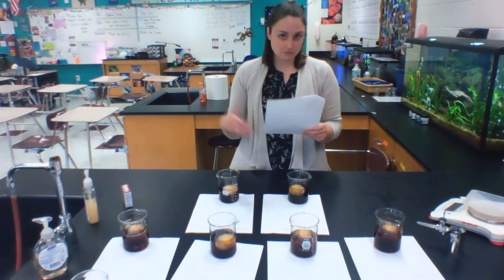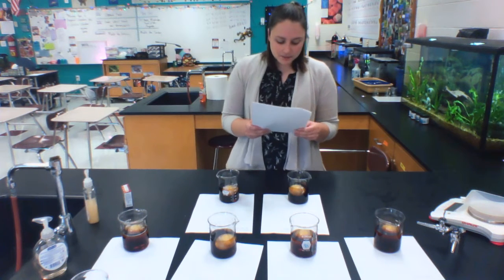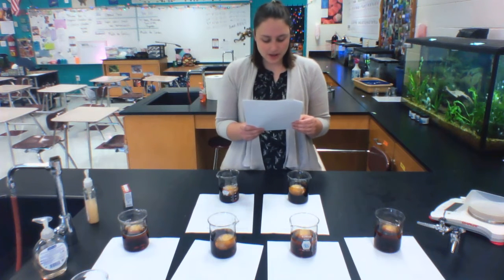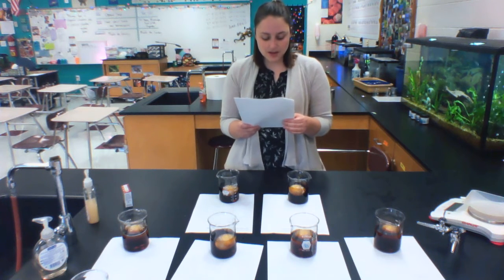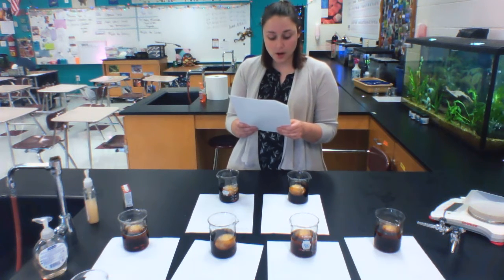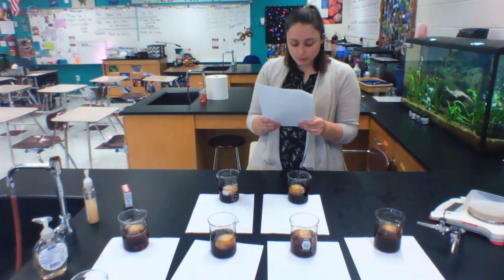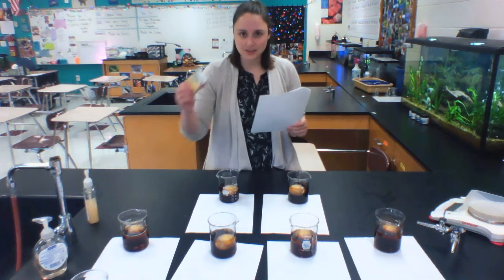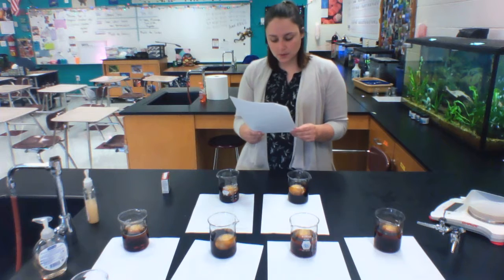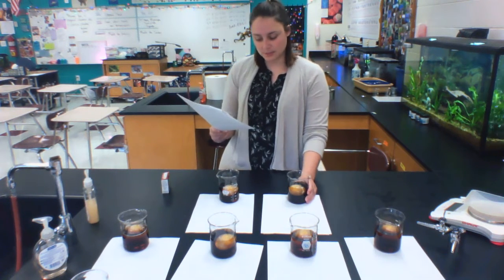Then that would be for us to continue on with our other eggs, which you won't see on camera, but I'll do it. Then you'll look at the egg and write 2 observations you'll notice about the egg in the chart besides day 4. Then you'll rinse the beaker again, removing the egg, and fill it halfway with water. Place the egg back in, and then fill it the rest of the way with water. And what we're going to do is we're going to actually include some food coloring with our water to see what happens. So next, we'll place the beaker back on its data sheet and have our observations about it.